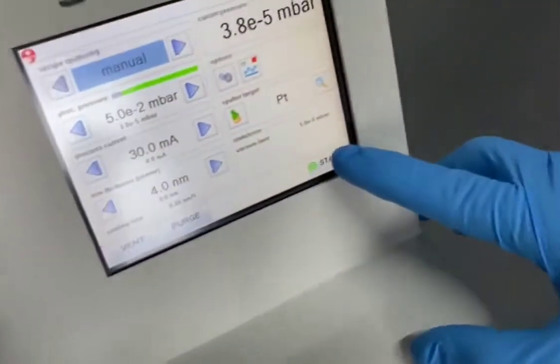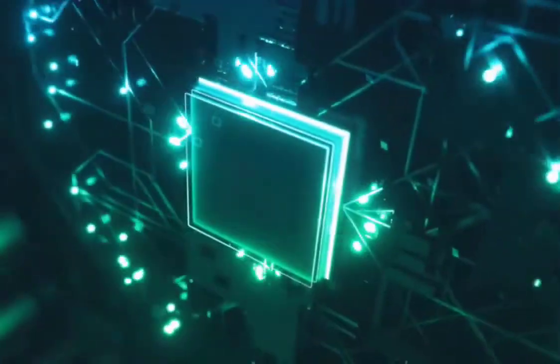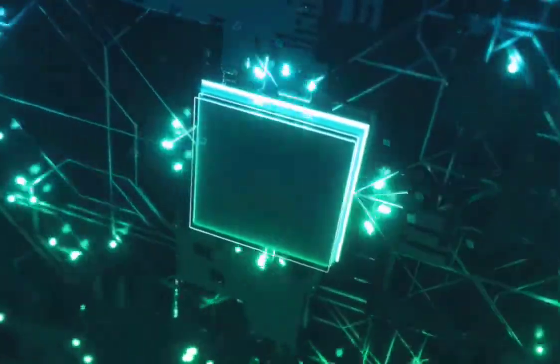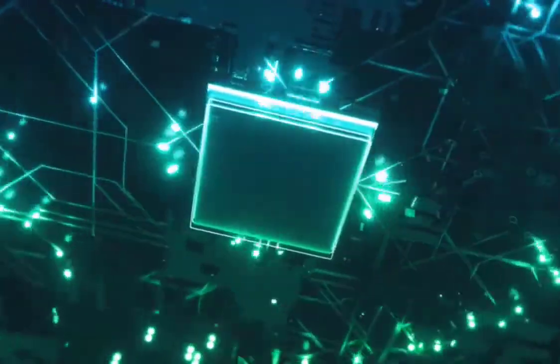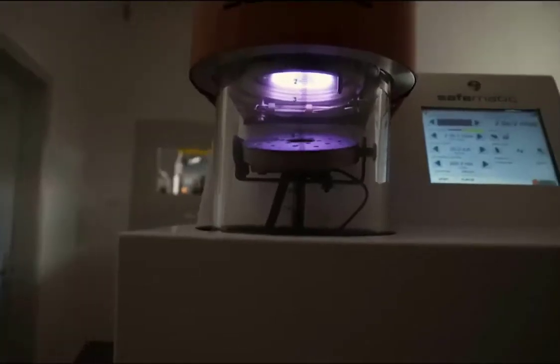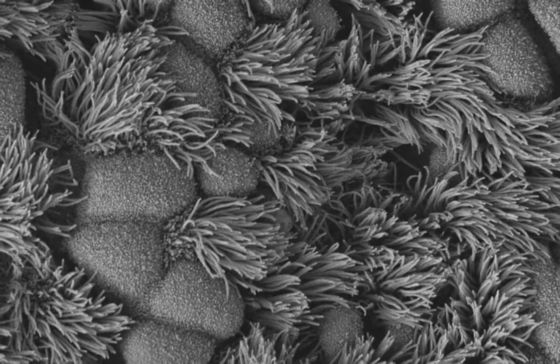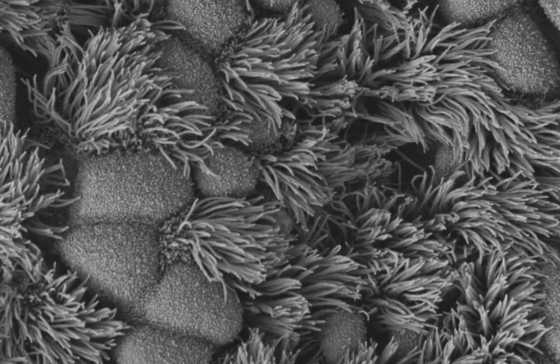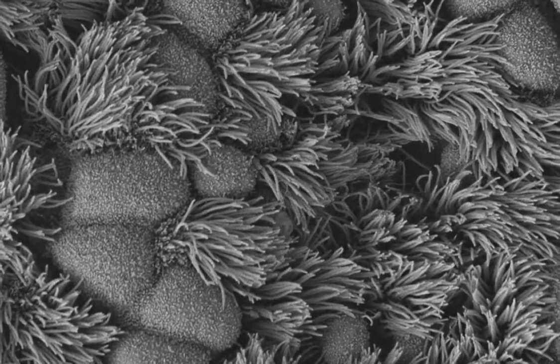One click is enough to start the process easily. It is fascinating when ideas work and we can be part of simplifying the lives of scientists and creating such great pictures.